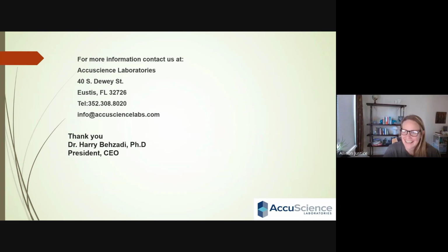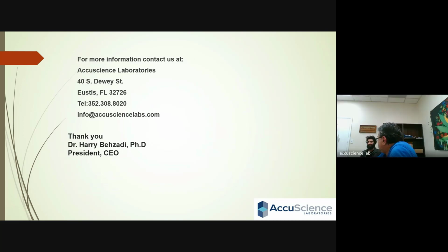A lot of our members love to dig deep. So if it's not any sort of IP protection, once you get the leaves, what happens? Is it a juicing type process, or how does that work? Yeah, we're still working on the juicing part of it. We have seen some YouTube videos where they use a garlic press to try to juice it. We have used juicers. We were able to get juice out of it.